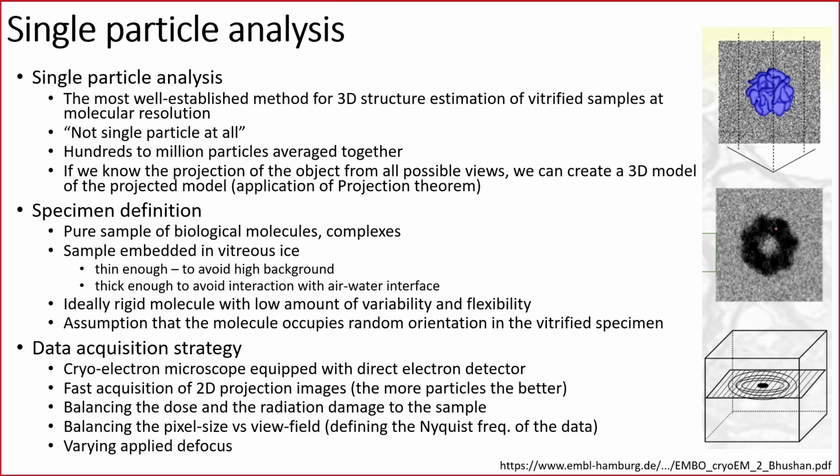The Fourier transform of this image is actually a single Fourier slice in a 3D space. So if we have just this one single Fourier slice, this is not enough to reconstruct our volume.